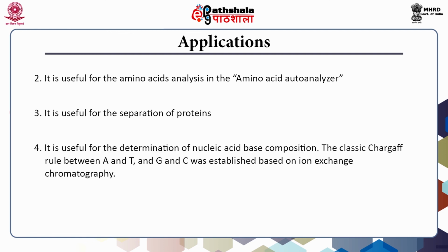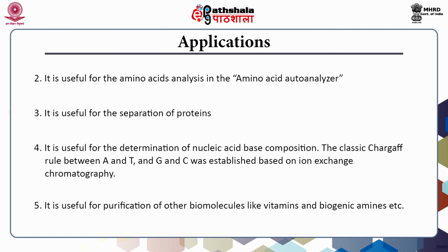One more important application of ion exchange chromatography is the determination of nucleic acid base composition. It is a very well known fact that the Chargaff rule, which tells that A binds with T and G binds with C, was mainly established based on ion exchange chromatography. In addition to proteins, nucleic acids and simple water purification, ion exchange chromatography can be used for many other purposes, for example, the purification of other biomolecules like vitamins and biogenic amines, etc.